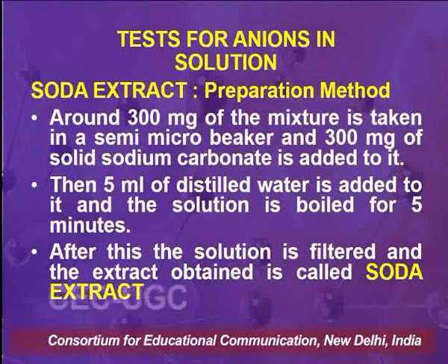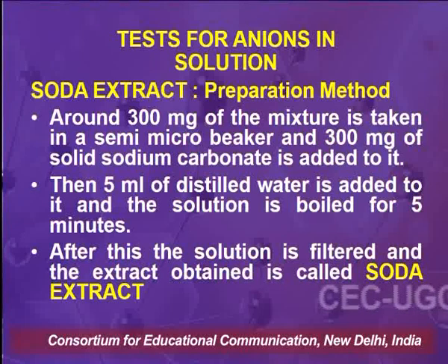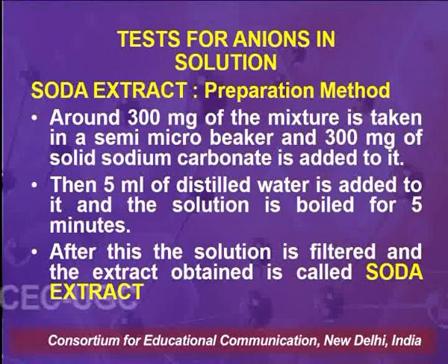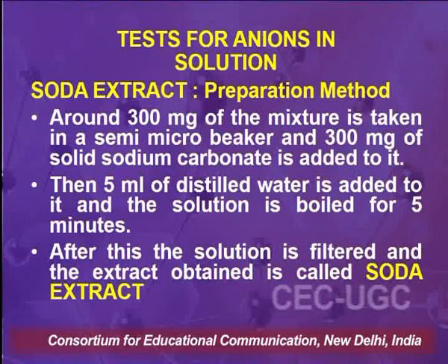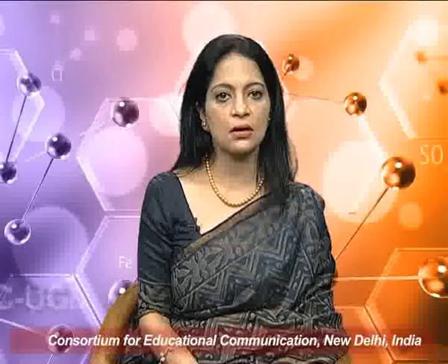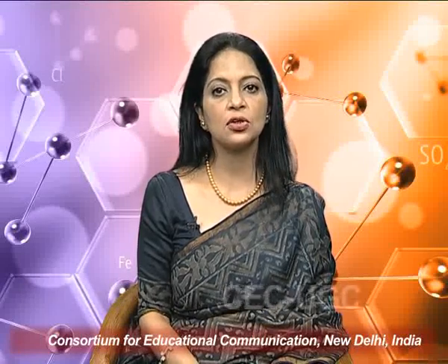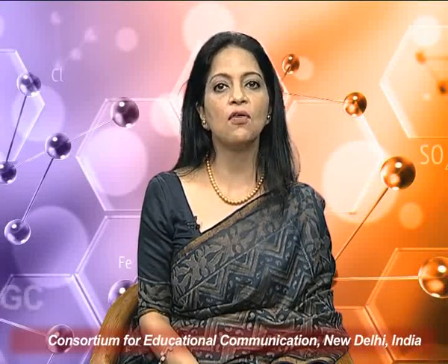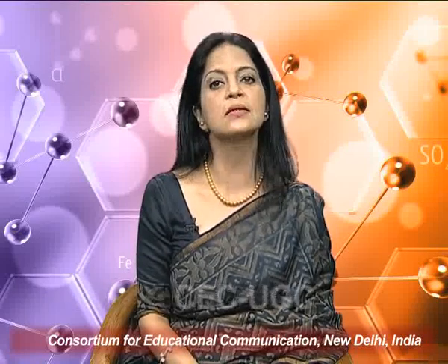After that, 5 ml of distilled water is added, and the solution is boiled for about 5 minutes. After this, the solution is filtered and the extract obtained is called the soda extract. The residue is discarded and the solution is further used for the detection, or rather the confirmation, of anions in the mixture.